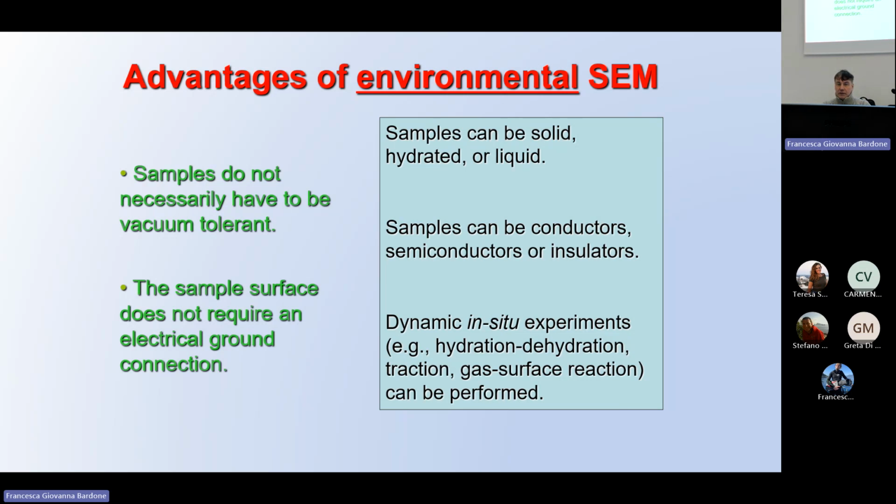Can sustain whatever type of interaction. Hydration, dehydration, you can change the temperature, you can change the pressure, you can change whatever. You can treat your material inside the chamber.